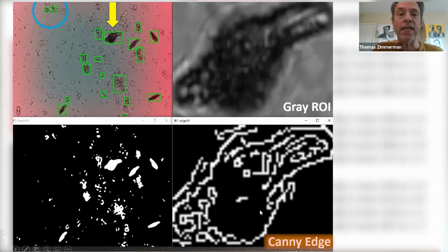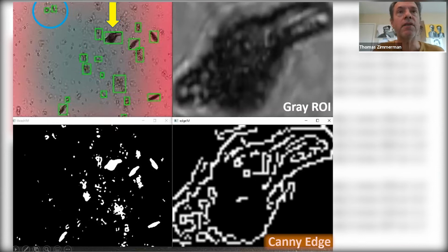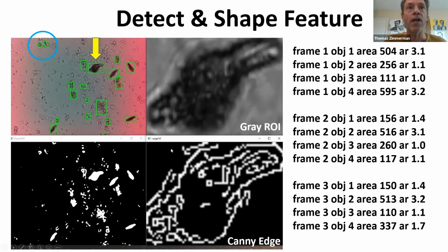So basically now I want to quantify texture. So what I'm going to do is count how many pixels are on. The only problem with that is larger objects that have the same amount of edges are going to be biased because they have more pixels. So to normalize it, so I don't discriminate against little objects and underestimate their texture and overestimate texture of large things, I'm going to count the number of pixels that are on, that are white, and divide it by the total number of pixels. So I'll get a fraction, a percentage of how many pixels are on, which will be a nice indication of how much edges there are, which implies how much texture there is.